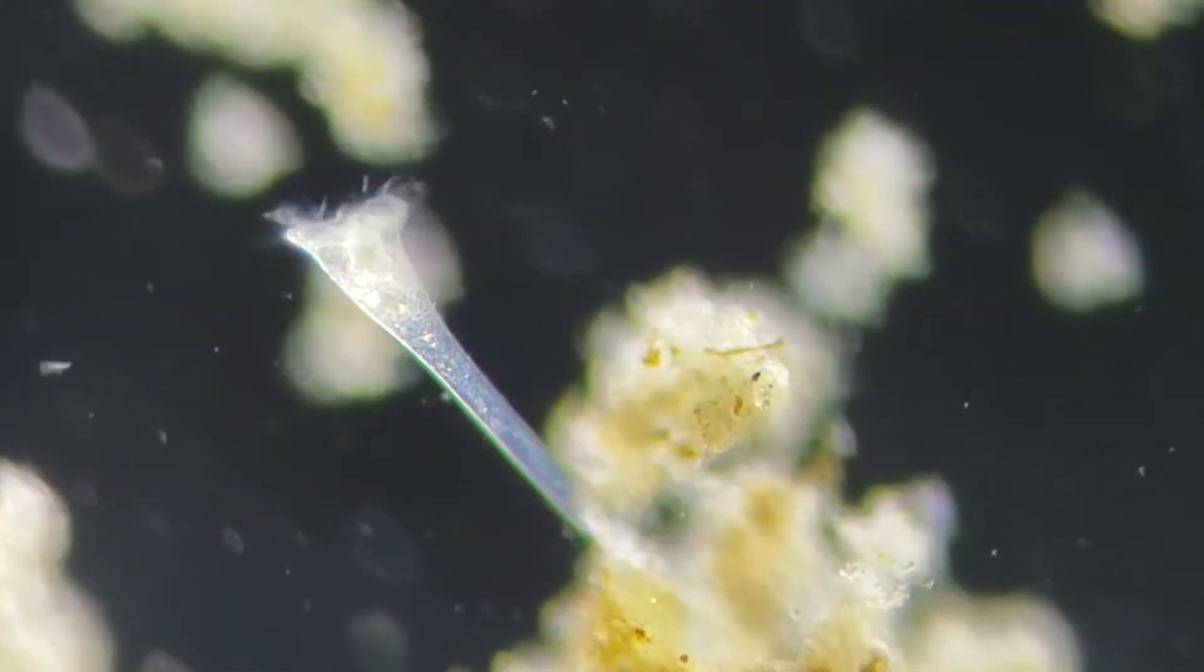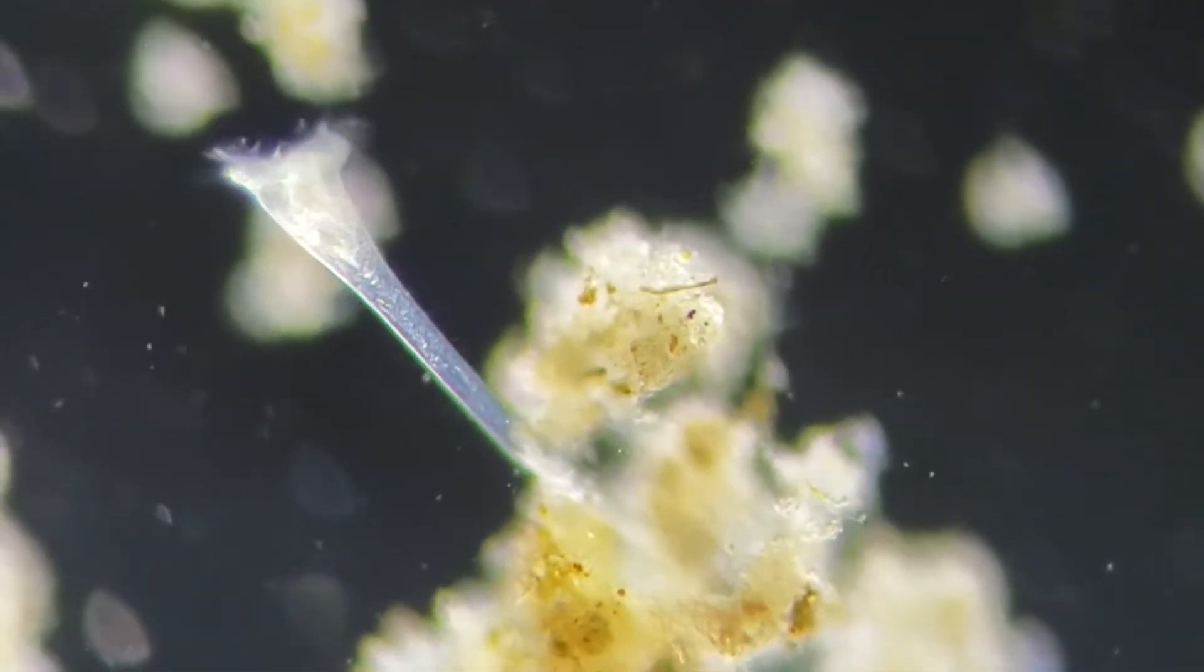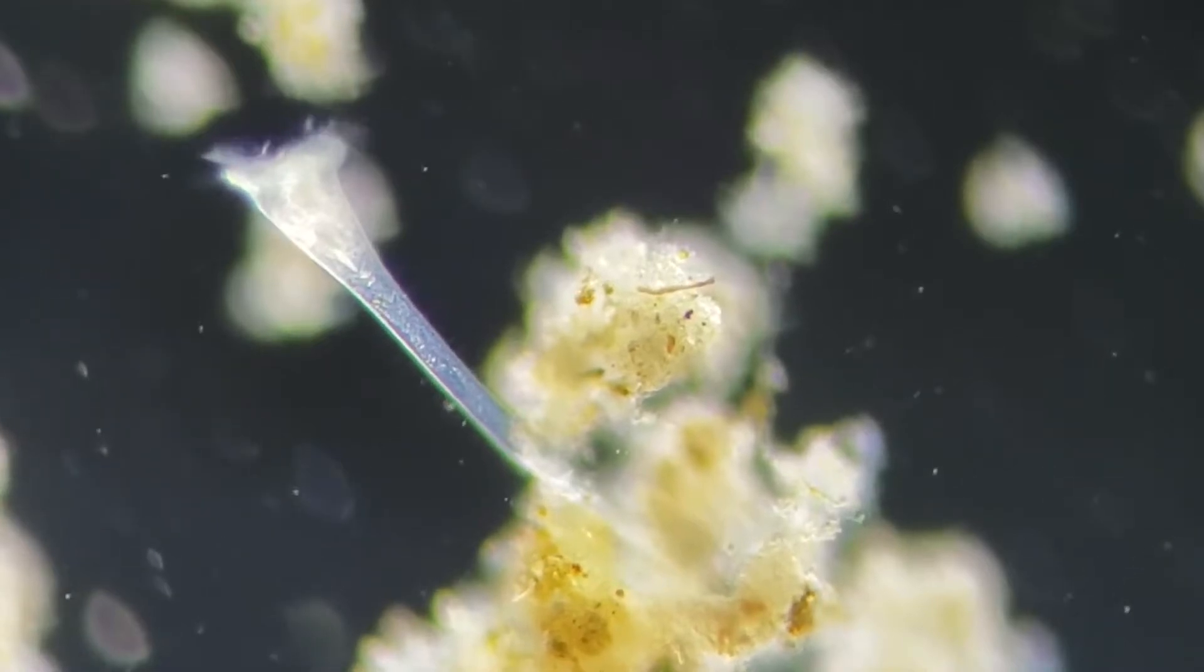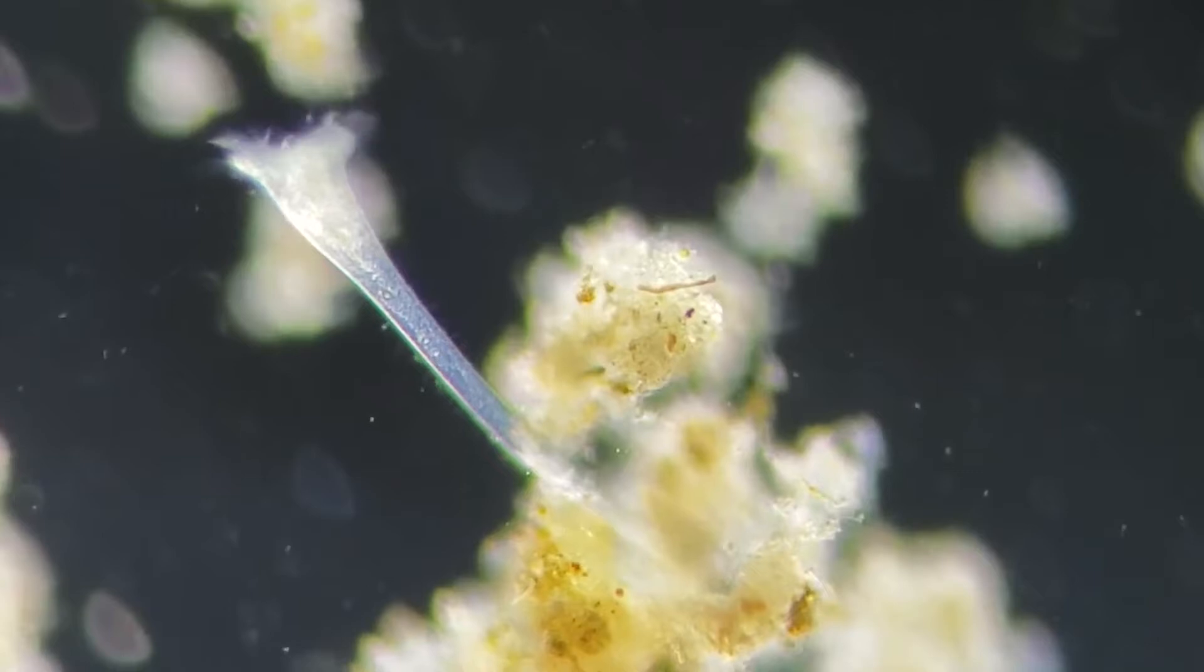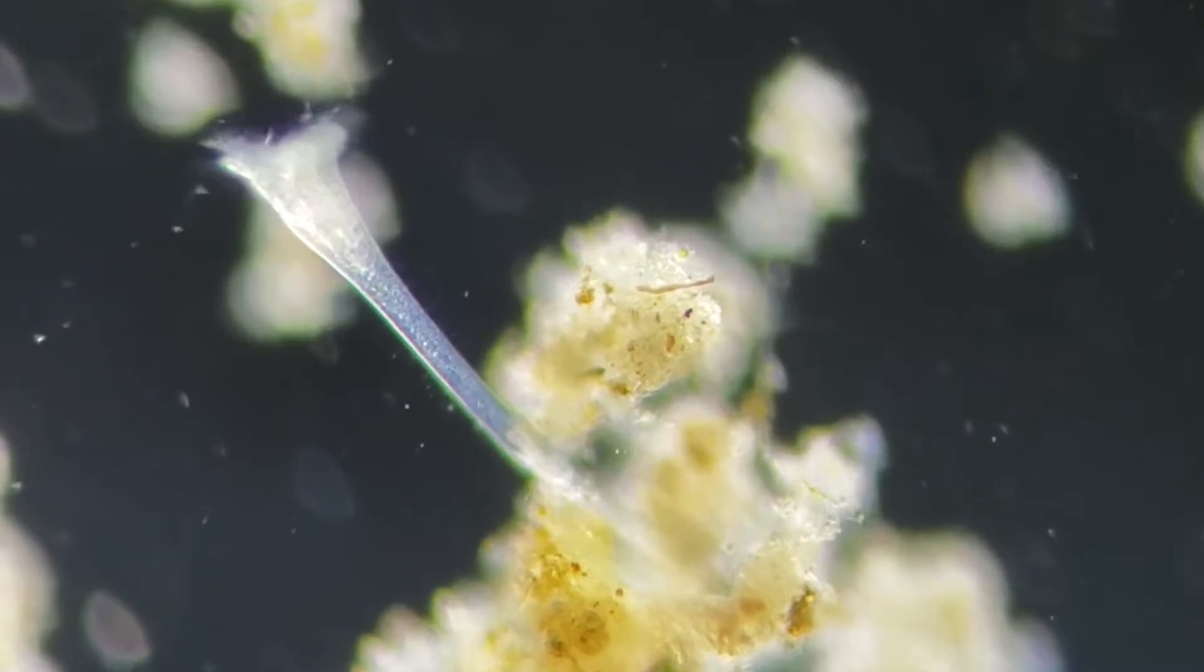I love a good mystery, and while there is no shortage of mysteries under the microscope, some of them come from unexpected places. In this episode of Microscope World, I will explore the mystery of a very unusual observation I recently made, and it may leave us with a few more questions than answers.